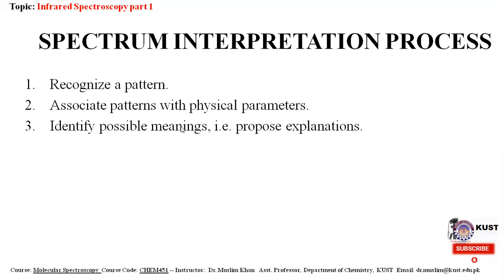We are extracting our desired explanation from the recognized pattern, which we need for the identification or quantification of any molecule or analyte.